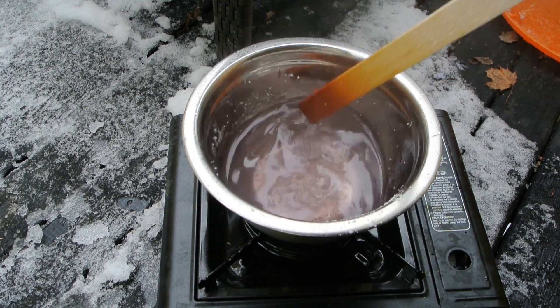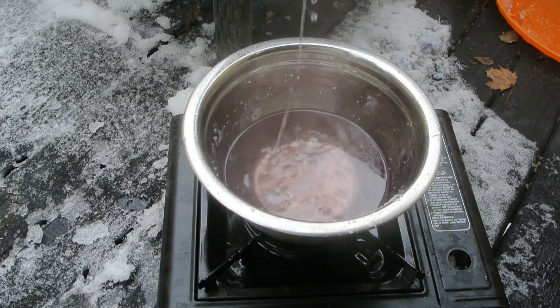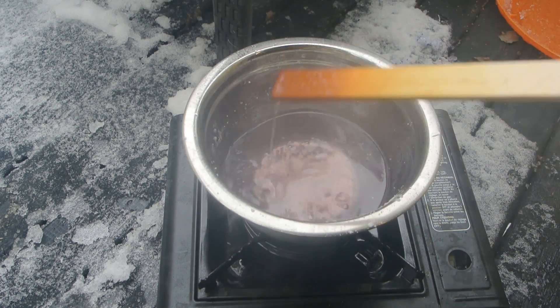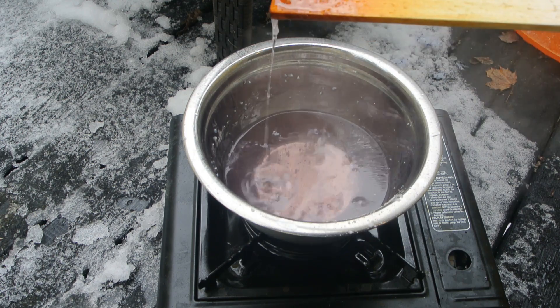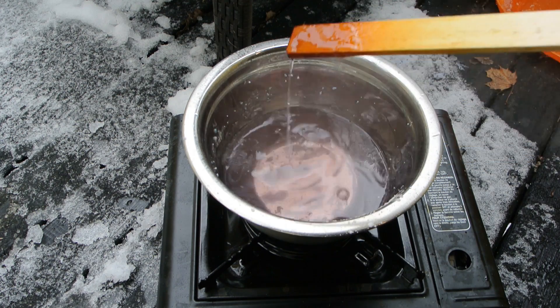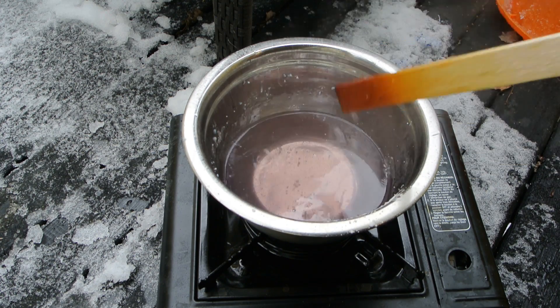Now it's nice and clear. It's very highly concentrated - you can see these little drops solidifying at the end of my stir stick. That means it's pretty concentrated.